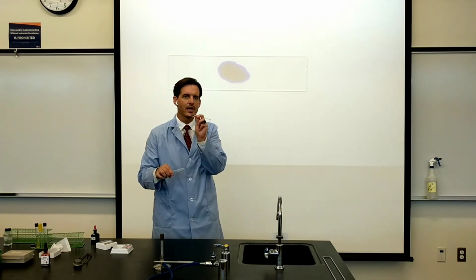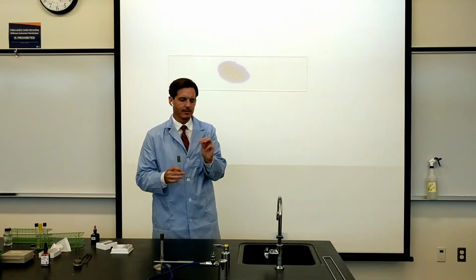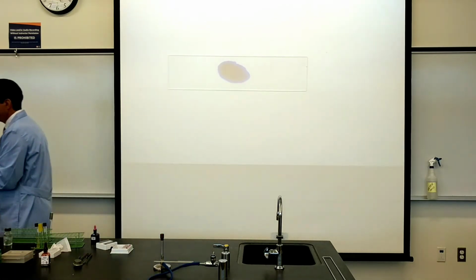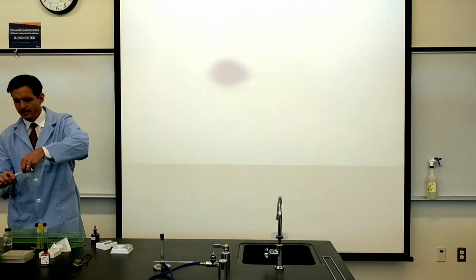All right, so I'll carefully get this out of here. I'm going to put this part against my cheek and move it around. I'm sure that, even though it's not like I drew blood or anything crazy like that, I did a good scraping that I could feel. Hopefully got some cheek cells. Doesn't have to hurt, but I'm going to move them around in the drop so that they're not just piled all in one place. Okay?